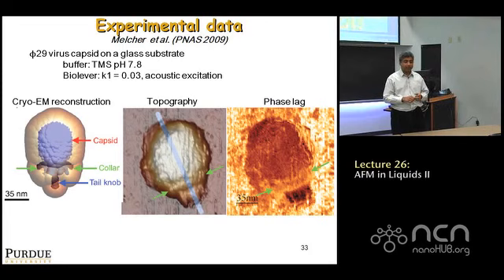And so what one expects to see if you do humidity control, as far as phase contrast is concerned, is, remember, when the tip interacts with the sample, in air, there's always this layer of water, and a meniscus forms and breaks. There is evidence that as you increase humidity, the losses due to meniscus making and breaking start dominating what you see in cantilever dynamics and phase contrast.